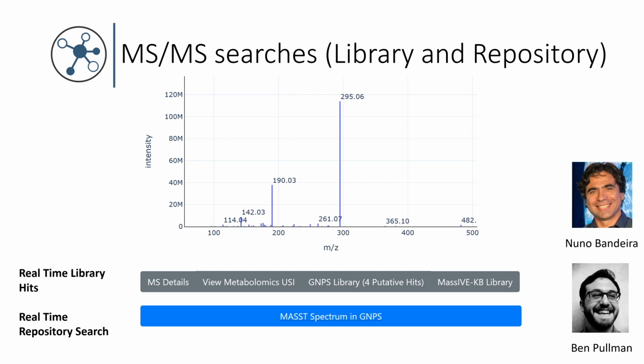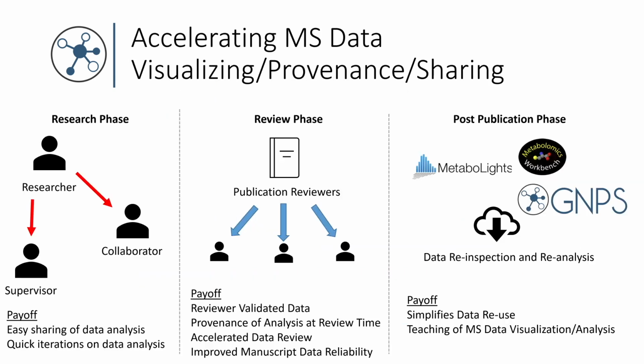And it does it even before you ask to do library search. It'll tell you, hey, there are 4 putative matches. Well, I didn't even ask, but now you're kind of curious. So we think that's kind of cool, this kind of pre-fetching, precognition idea.